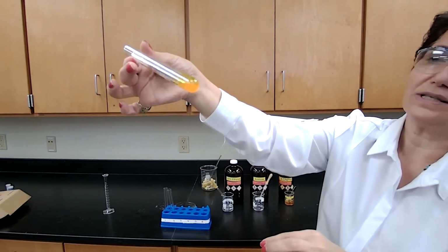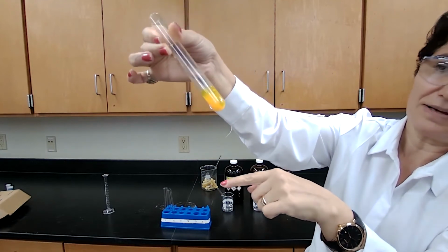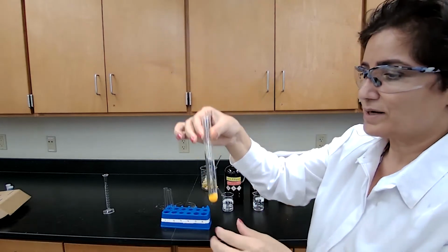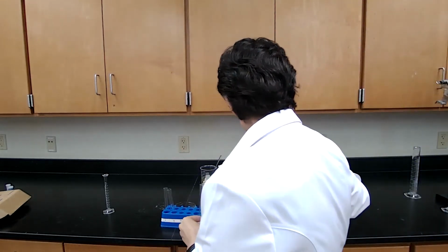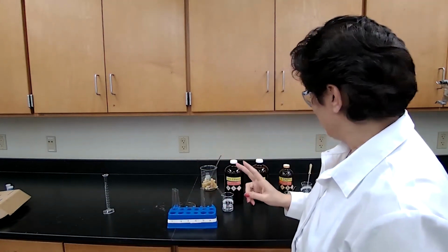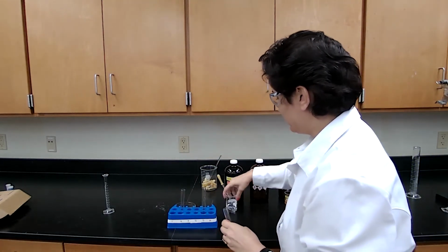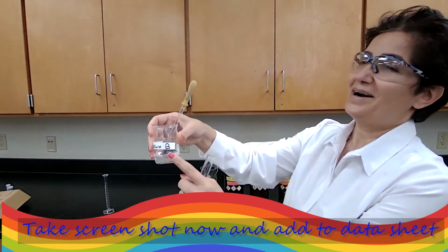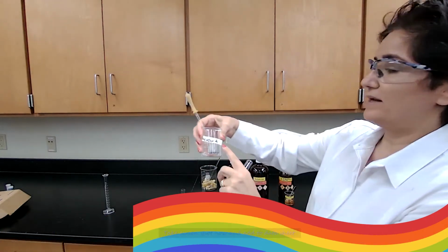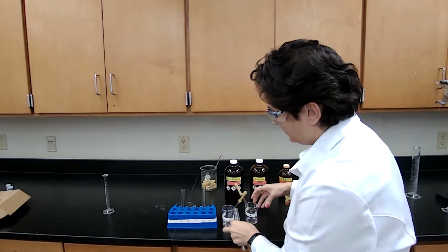You see, I want you to see the difference. This is cloudy, it's not transparent anymore. It is a cloudy mixture, a yellow color precipitate forms, a positive test for ketone. And we are going to use unknowns for this mixture. Actually, I'm going to use two unknowns. I have unknown B here, and I have one more unknown here, unknown A. So I have unknown A and unknown B.